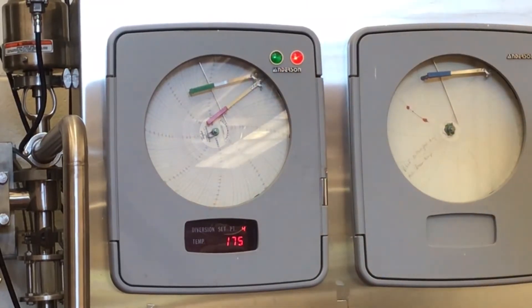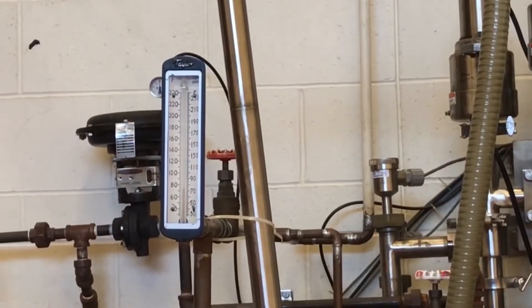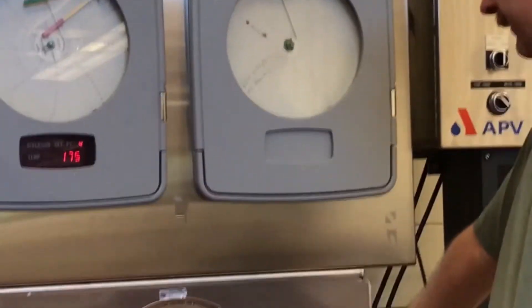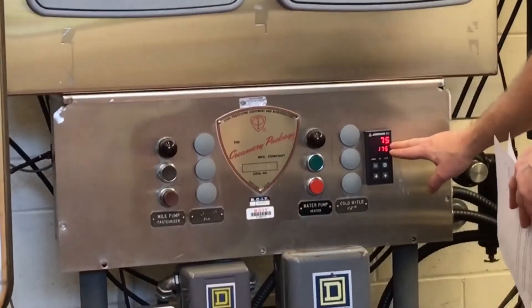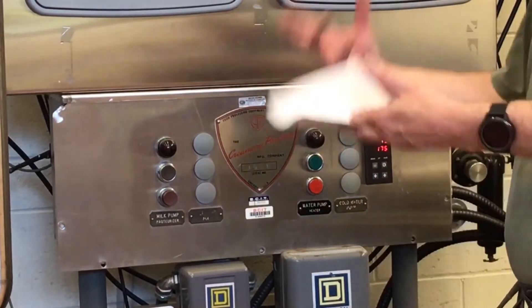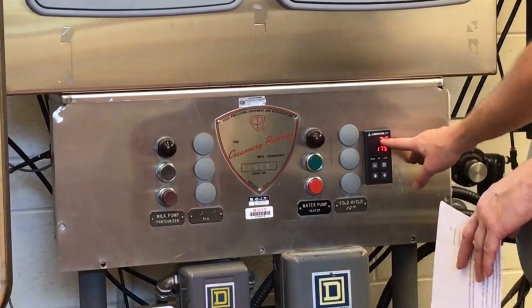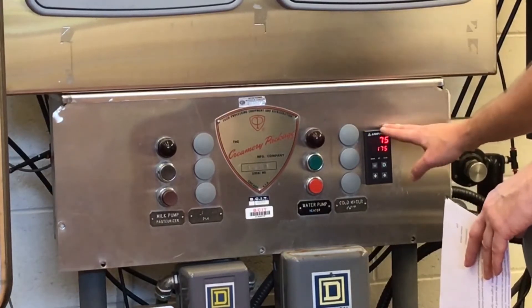We need our water temperature above our pasteurization temperature, and that comes from the steam valve. We have another controller here that is measuring the water temperature — our set point is 175 degrees. It's showing 75 right now because the system's not running, but if the system was running we'd see the actual hot water temperature displayed on this device.